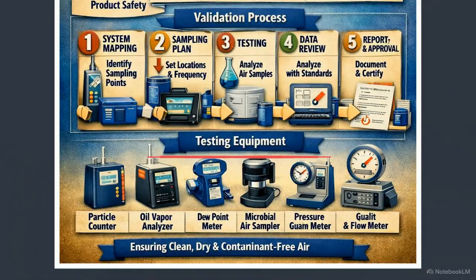This banner displays the specific diagnostic equipment used during the active testing phase. Each contaminant requires a dedicated, specialized instrument to accurately measure it. We separate the threats into non-viable and viable categories. A highly calibrated particle counter is deployed to measure physical dust and solid particulates, while a specialized microbial air sampler captures living bacteria and fungi for laboratory incubation.